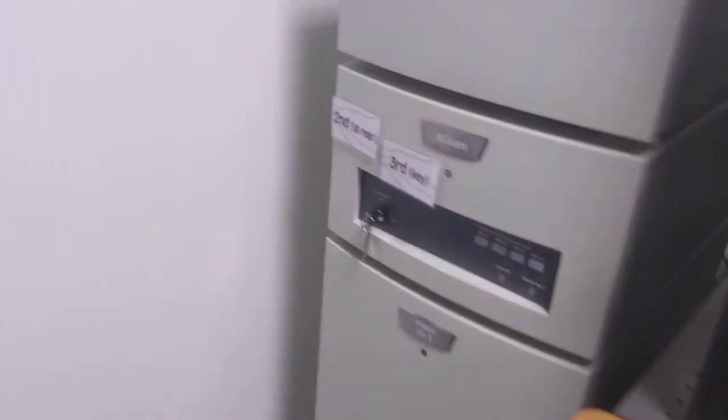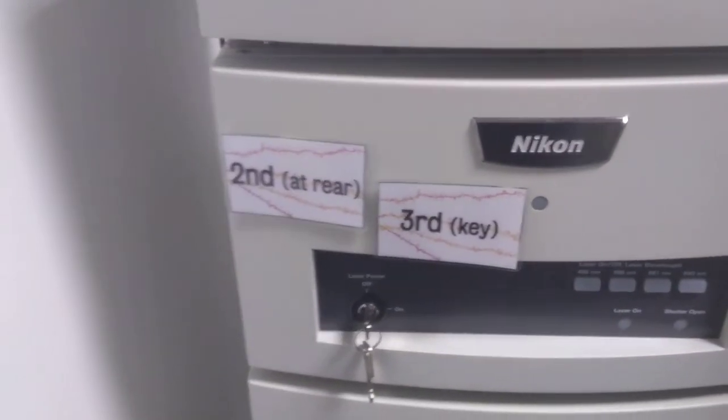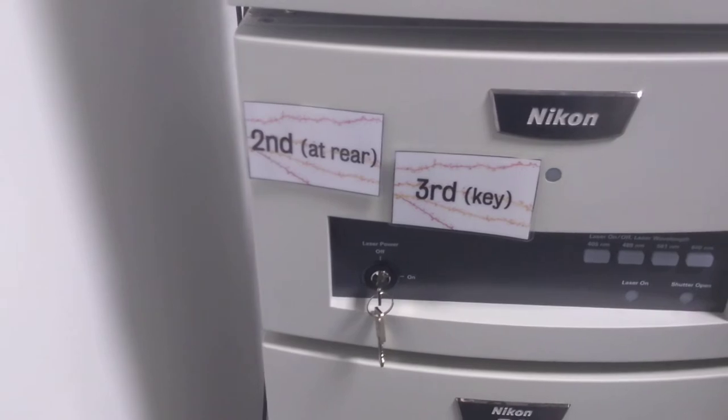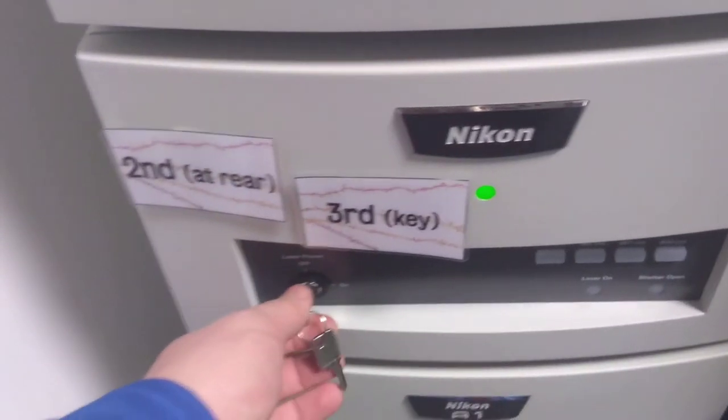After this, you can then proceed to turn on the visible laser system. The switch can be found at the rear of this unit, and then you can turn on the interlock key.